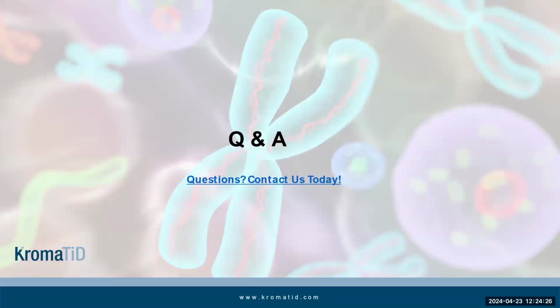There are definitely cell lines that have special media and special media additives that can sometimes interfere with the uptake of the analogs that we use for DGH. So talk with our technical experts to make sure that our analog is compatible with your systems. We've only found one or two cases where we needed to change up the culturing conditions of the cells in order for effective uptake of the analog to occur.